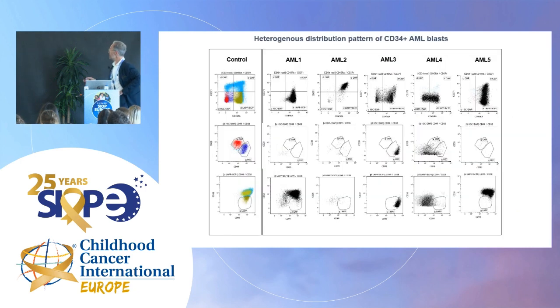And if we compare, for example, different leukemic cases, every leukemia does what it does, you know. Some look like GMPs, for example, some look like LMPPs. So really, some fall out of the regular gates, for example, because they underexpress CD38, or overexpress CD99.